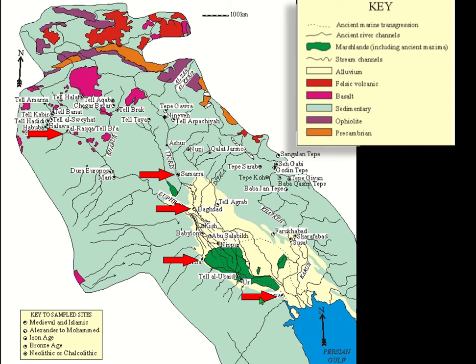One was the Basra fabric, one was more suitable to this area, and of course I also studied the Chalcolithic pottery of Samarra. One from probably around here, which is probably Baghdad, and one which was like further down, more like the Tell al-Ubaid, Nippur sort of area, which I thought probably this must be Kufa.